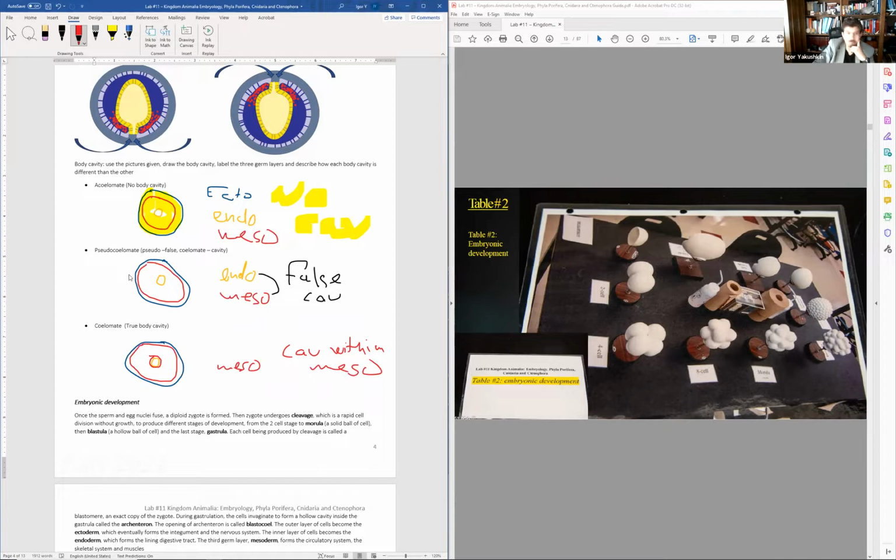Make sense? Yes, beautiful pictures, I know. But if I were able to do that within literally 5 minutes, you probably will be able to do that a little bit better. Again, you can just copy and paste it, but I would recommend you draw it. That way you can visually see it.